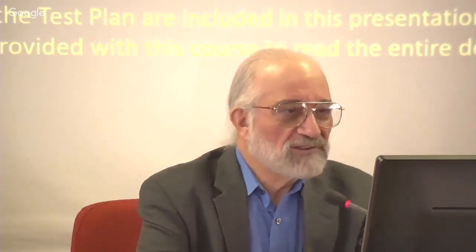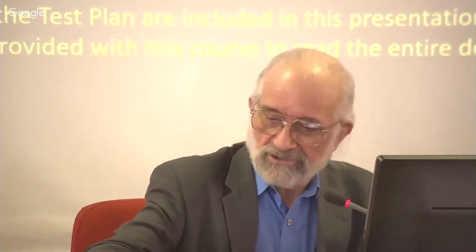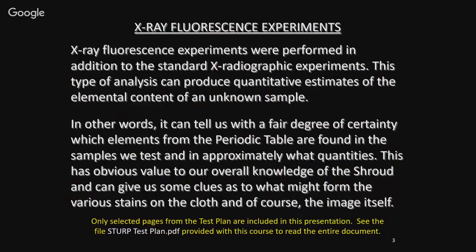So the X-ray fluorescence experiments were performed in addition to the standard X-radiographic experiments. This type of analysis can produce quantitative estimates of the elemental content of an unknown sample.